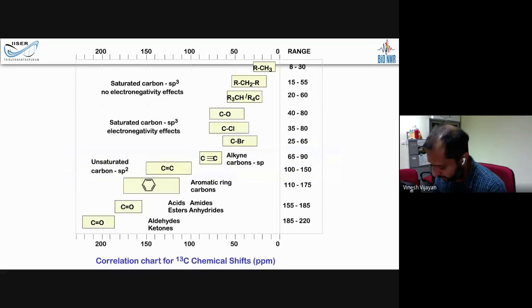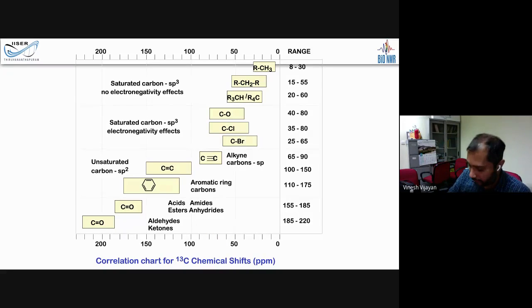Carbon-13 chemical shift is very similar, just like you have de-shielding, and the range, of course, is from 0 to 200 and above ppm, but the behavior is very similar. So going to lower ppm value means more shielding, going to higher ppm value means more de-shielding. The aromatic region comes around 120 ppm. The carbonyl carbon comes around 200 ppm. The aliphatic region comes very close to 50 to 30 ppm, some 20 to 30 ppm, and even lower. Carbons attached to OH or an electronegative atom come somewhere above 60, 70, 80, 90 ppm, like that.